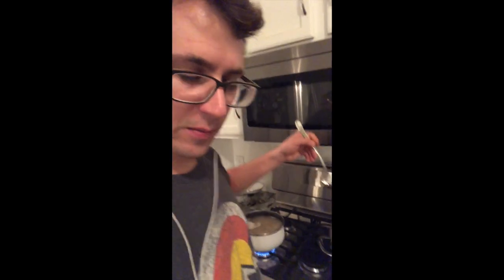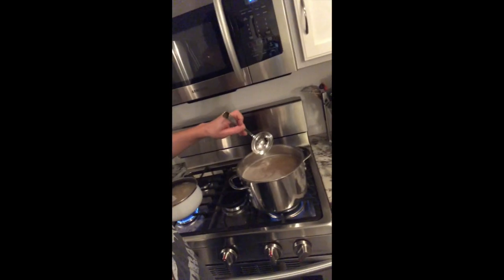All right, so this agar is almost dissolved now. I'm just going to start ladling this into this 2-liter glass jar, and then I'll throw it in the pressure cooker. While that agar is pressure cooking and sterilizing, I am going to prep the hood.